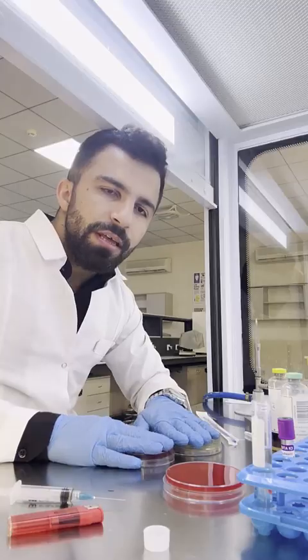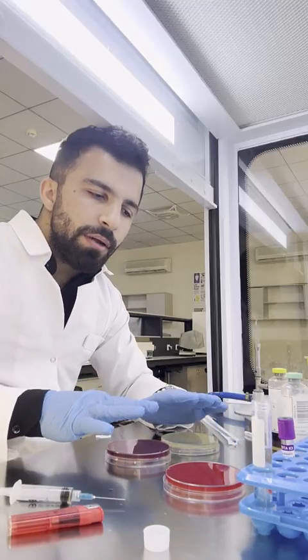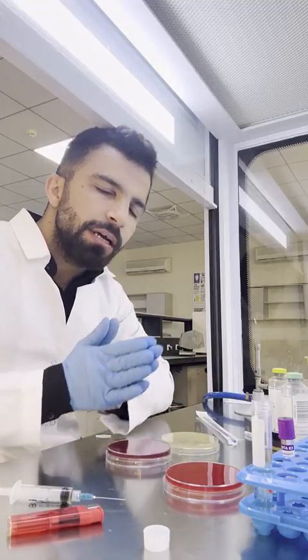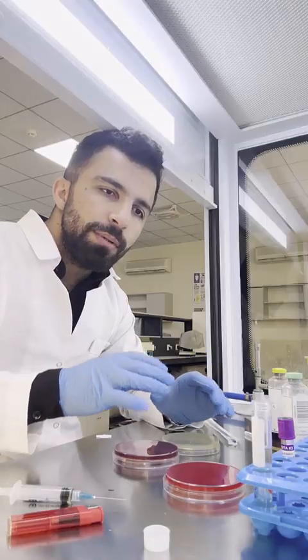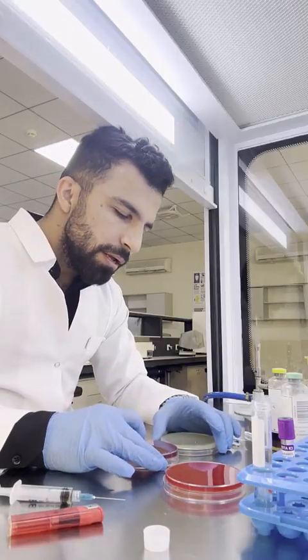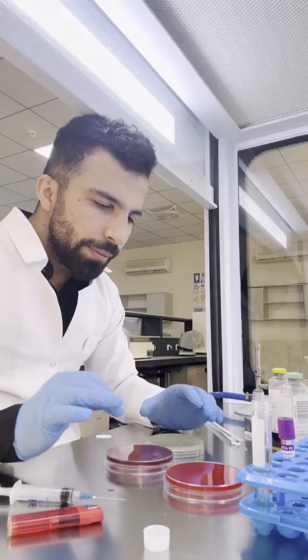Now we have the blood culture and urine culture ready. After completing the culturing on agar, we're going to put them in an incubator at 37 degrees for 24 hours, and we're going to put them upside down, and that's all.